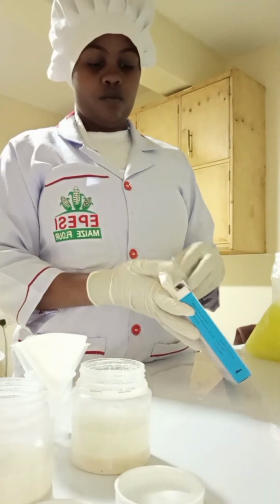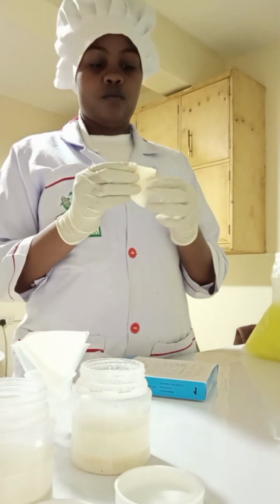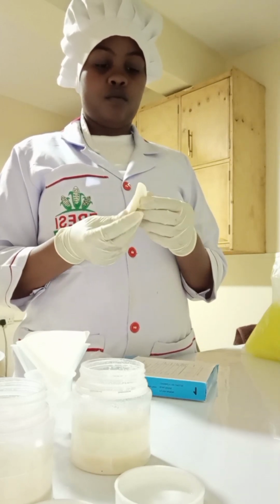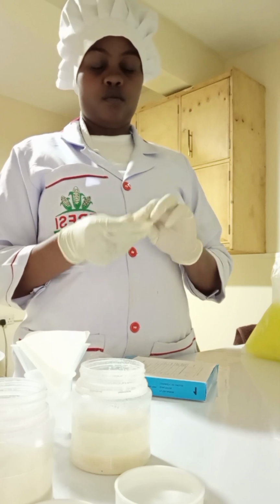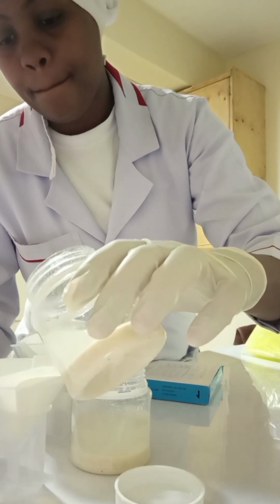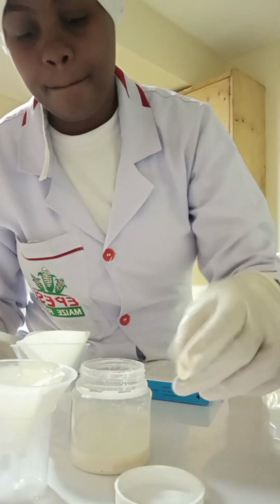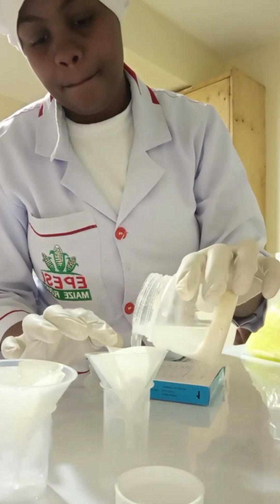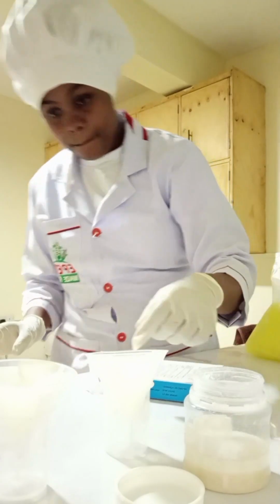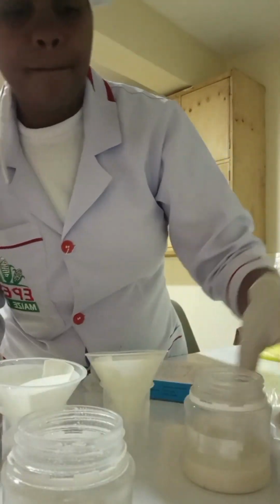So this is me doing the filtration so that I can obtain the filtrate. I was preparing the sample in the plastic jar. Now I'm transferring the filtrate to a beaker. Make sure that if it's labeled sample A, it goes to the beaker for sample A. If it's sample B, it goes to sample B.